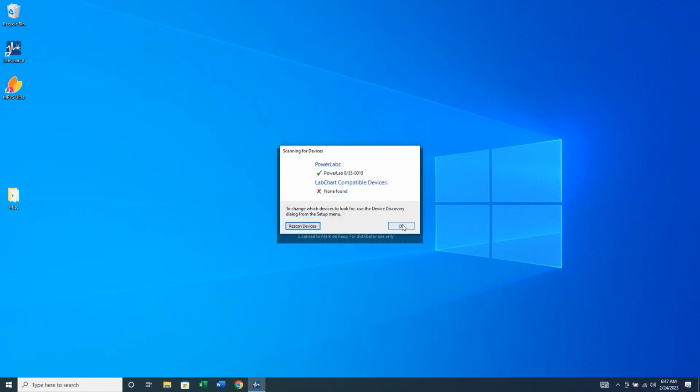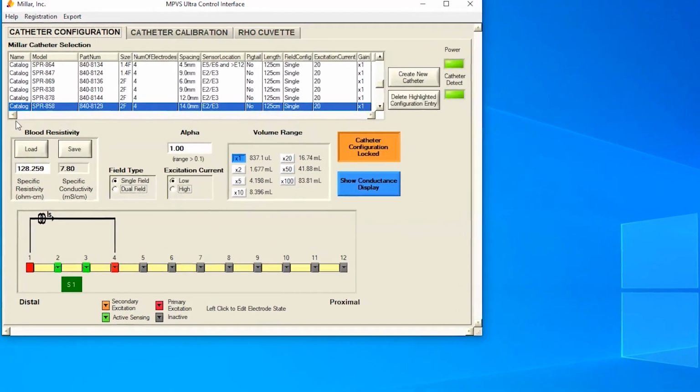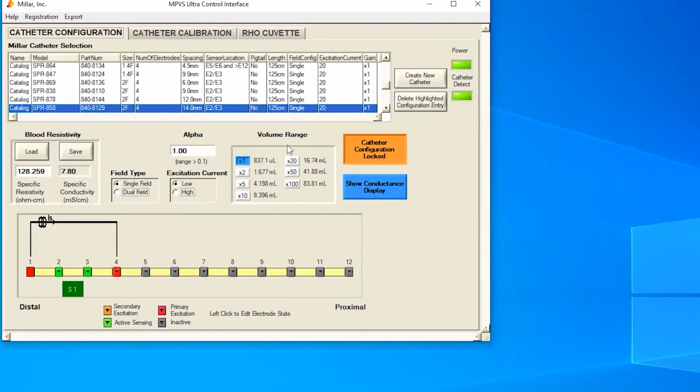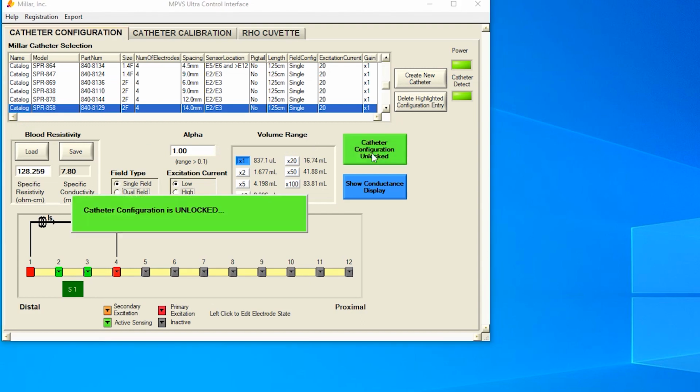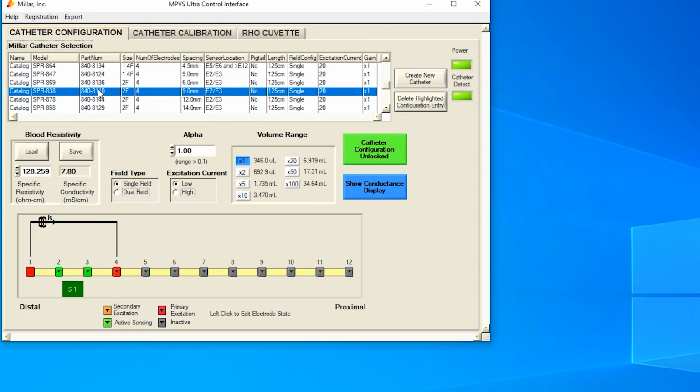Start LabChart and the MPVS control software. Looking at the MPVS Ultra control interface, click on the orange Catheter Configuration Locked button. Now we can select the correct catheter in this list. For single segment catheters, this is all that needs to be done on this tab. Now, click on the Catheter Calibration tab.